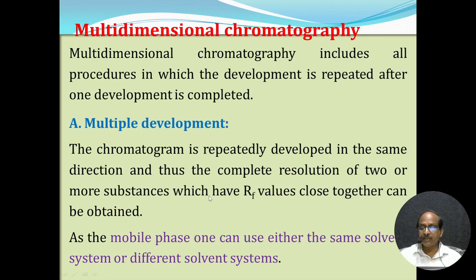For the mobile phase, one can use either the same solvent system or a different solvent system. You can take one solvent, no problem. You can take two different solvents, no problem. We can use that in multi-dimensional development.